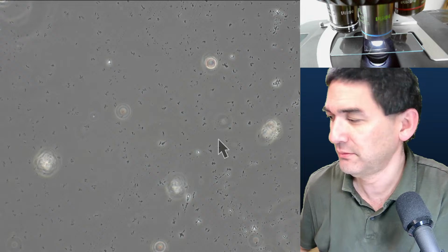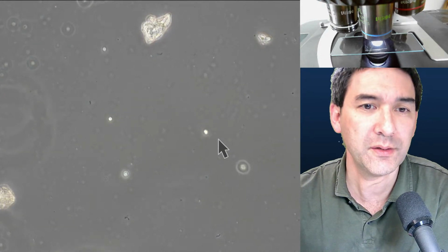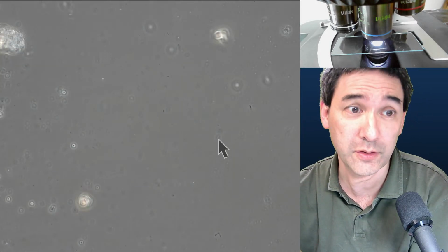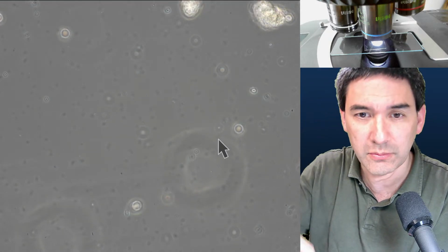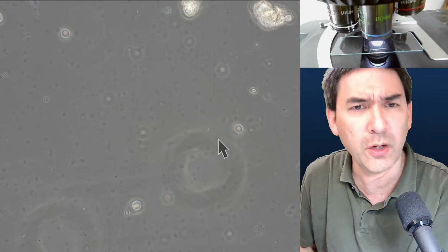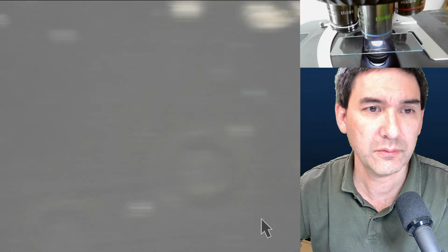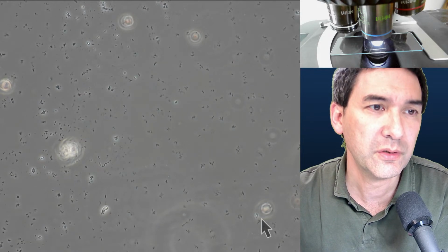What is this? Why is there this thing moving around? This must be clearly a contaminant. That's way too large for a bacterium. I don't know, it must have somehow found its way into this tiny little dish here. I always exchanged the pipette tip, so it couldn't be a cross-contamination. That's interesting. But you see, I just wanted to show this to you here.